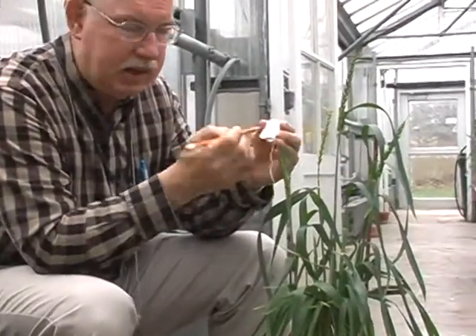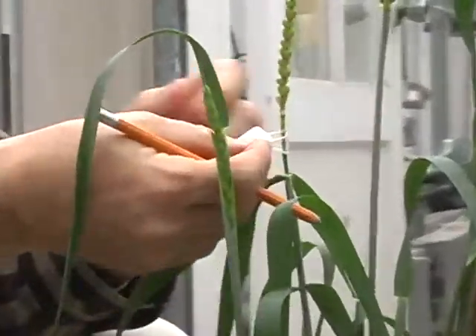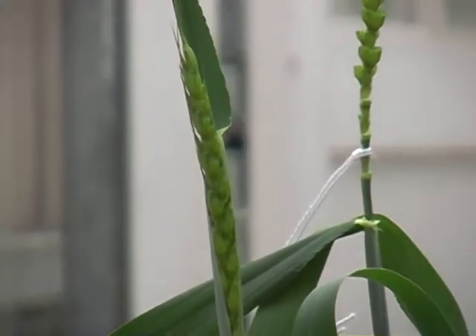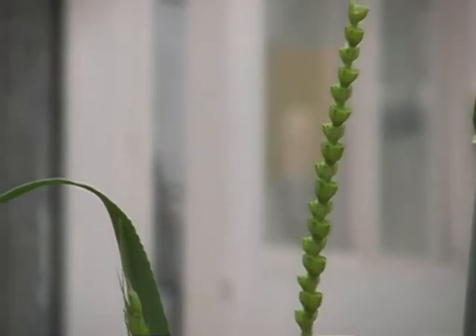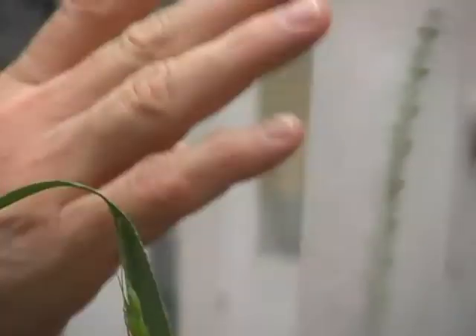Now what we do is put the date and the pot number on the label, then put the label around the spike. Then we cover the spike so no stray pollen — because there's a lot of pollen in this greenhouse — could get onto this female. We want to pollinate it only with the male of our choice. So now it's protected.